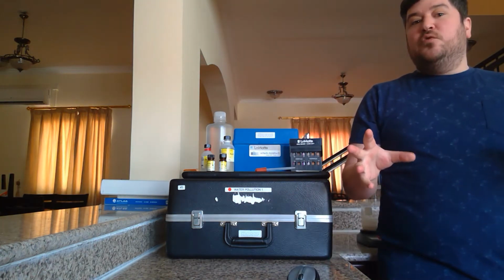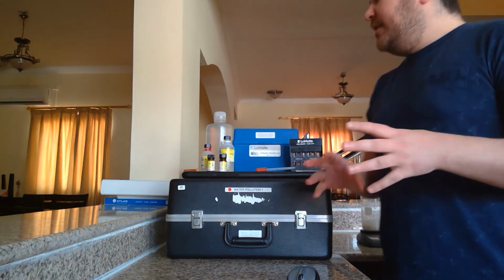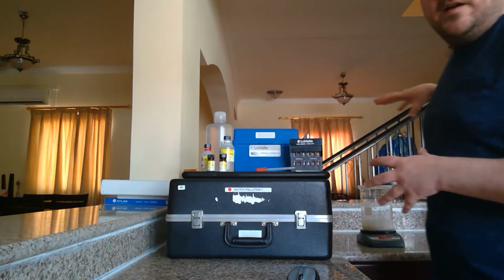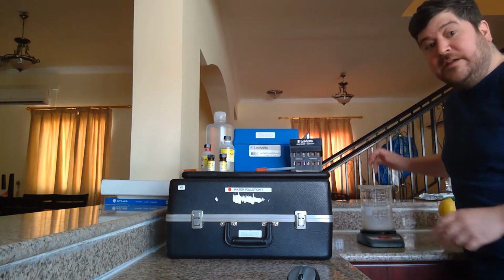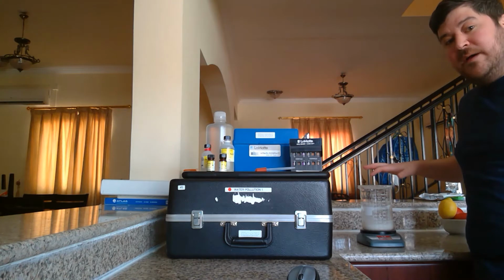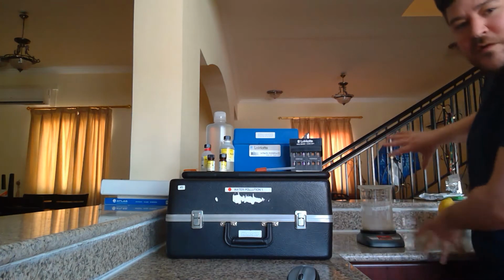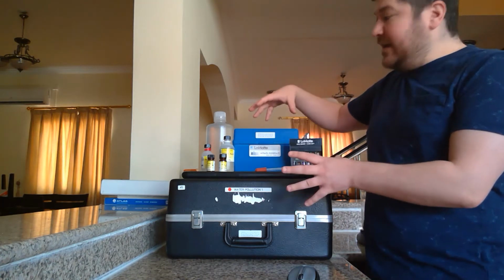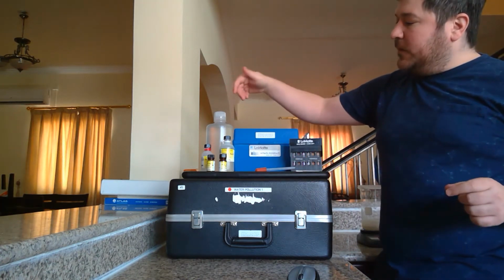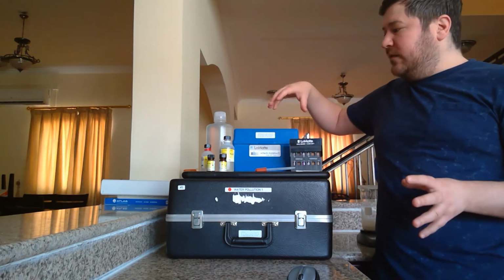Before I actually do the experiment, I should run over the equipment that's in this phosphate test kit. You can kind of see behind me, through the magic of YouTube and editing, I've already done the dissolved solids lab. That takes a lot of time, but I have this resting here, so just ignore this until next week. But this kit I'm going to use right now with this sample, and it involves a few things. It's a pretty quick test.